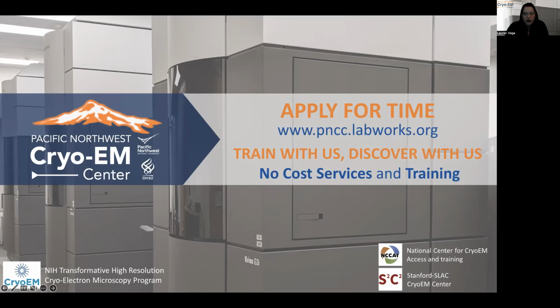We have 5 scopes. So we have an Arctica with K3, and we have 4 Kriosess with K3. 3 of those have Falcon 3, and 1 has been upgraded to Falcon 4. 3 of them are also equipped with energy filters and have been upgraded to fringe-free imaging, with the final one undergoing that this month. For our sample preparation, we have our Vitrobot and Leica GP2, but our Chameleon is back at the factory. Last month, we ran our sample preparation workshop, and we'll be holding a data processing workshop in November and our CryoEM introductory training workshops in December, both of which are remote. So apply today if you're interested.